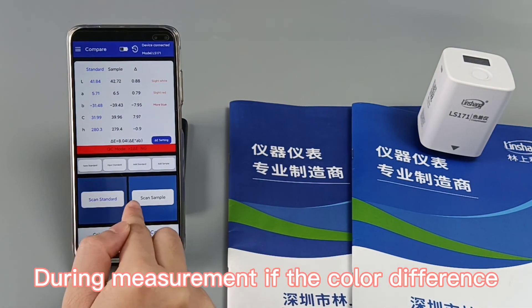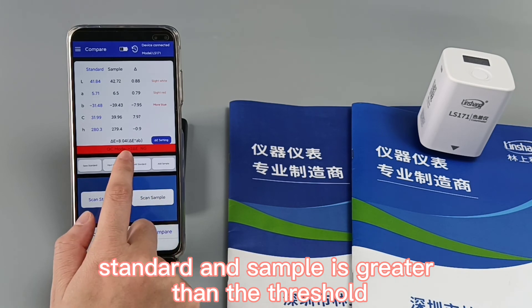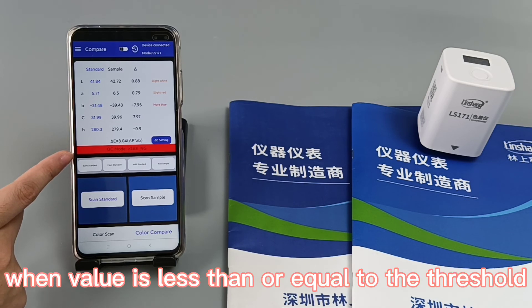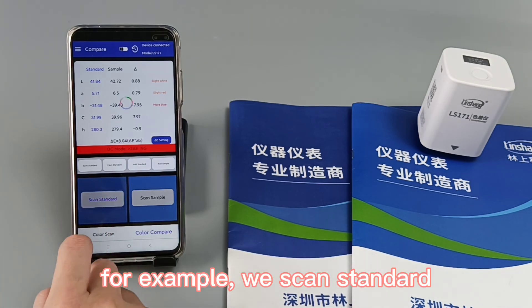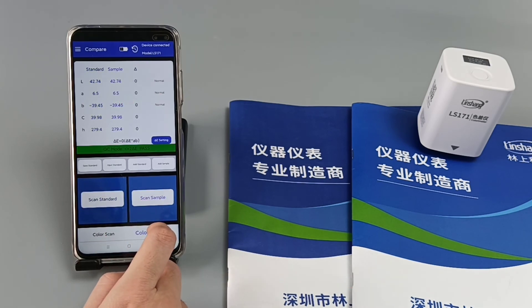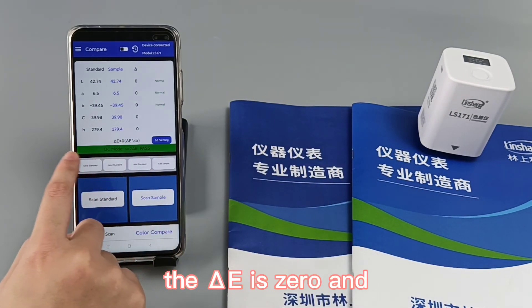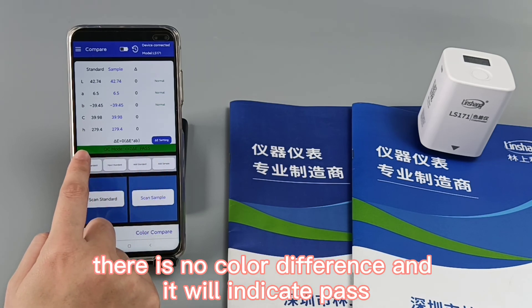During measurement, if the color difference between the standard and sample is greater than the threshold, it will display NG and this area will be highlighted in red. When the value is less than or equal to the threshold, the meter will display pass. For example, scanning standard and sample in the same location gives a ΔE of 0 — no color difference — and it indicates pass.